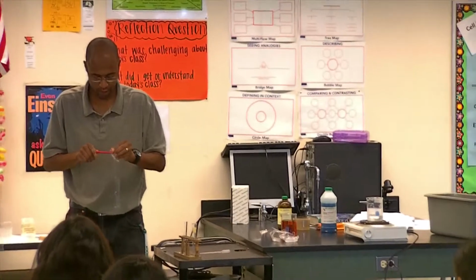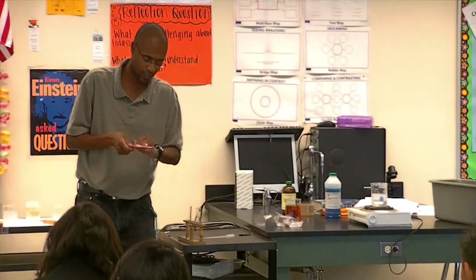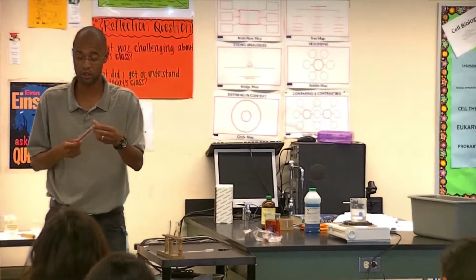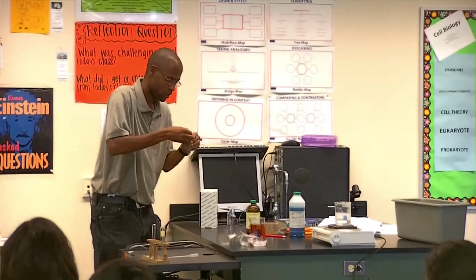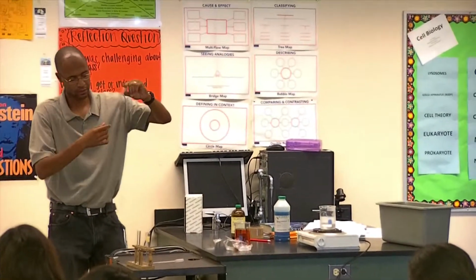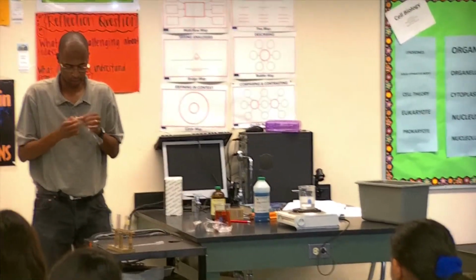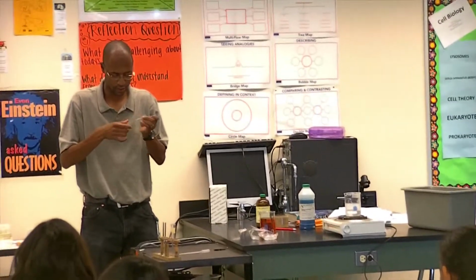Use the pencil to open it up so we can put the contents inside of it. We're going to be looking at two things today. Some of this may be a little bit of review of what we did when we did the macromolecules test. Now this is open. I'm going to tie the other end so whatever we put in here does not come out. I'm going to tie this dialysis tubing very tightly so nothing comes out.